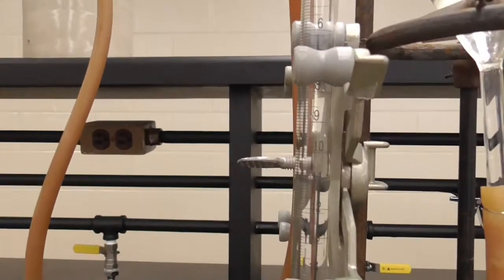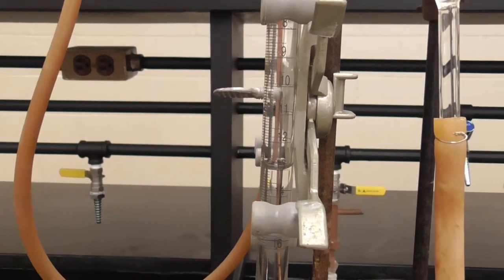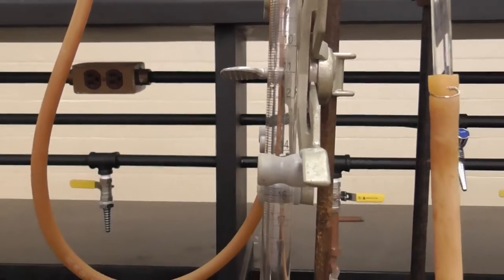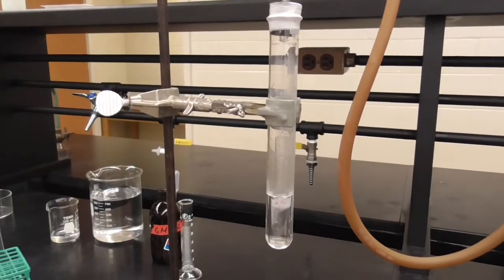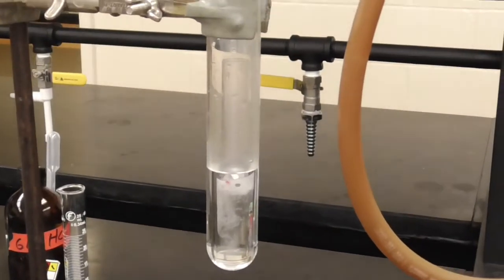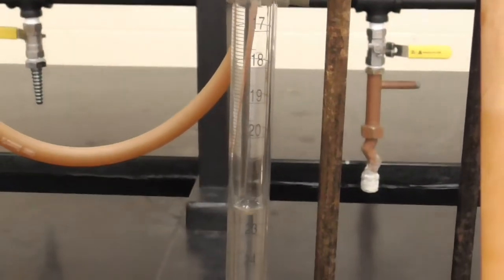Okay, now you can see that the level in the burette is dropping rather quickly. And if Dr. Dene swings over to look at what's happening in the reaction flask a moment, we can see that it's bubbling quite vigorously. And now if we go back and look at the burette, we see that it is dropping rather quickly.